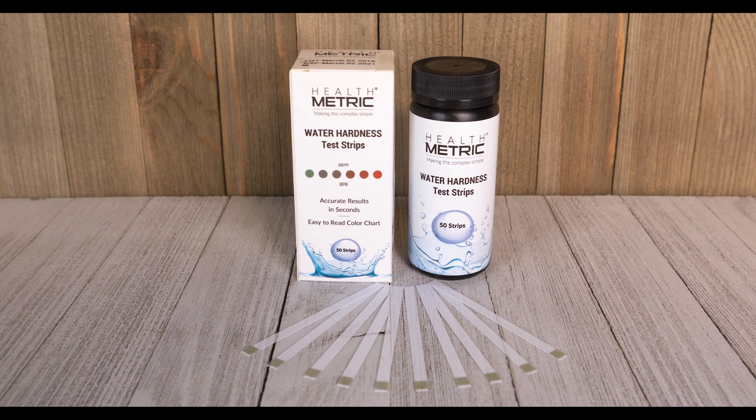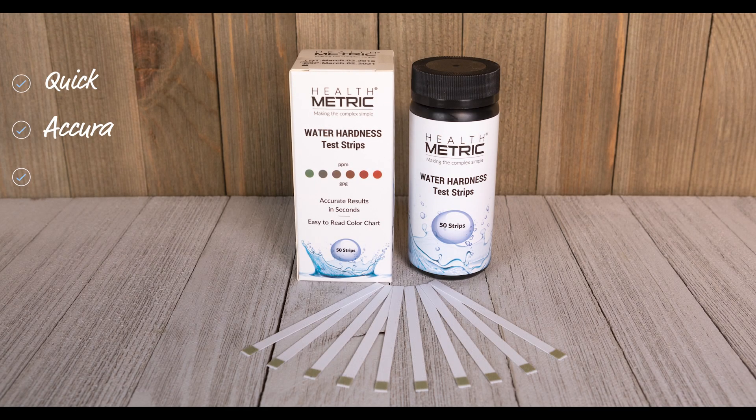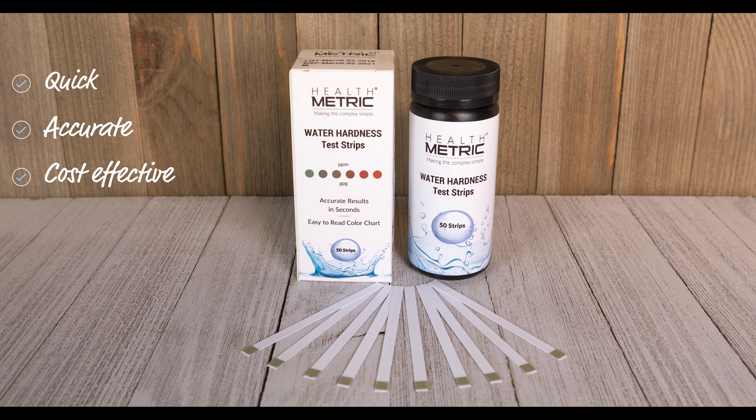The HealthMetric Water Hardness Test Strips provide a quick, accurate, and cost-effective way to monitor water hardness at home.